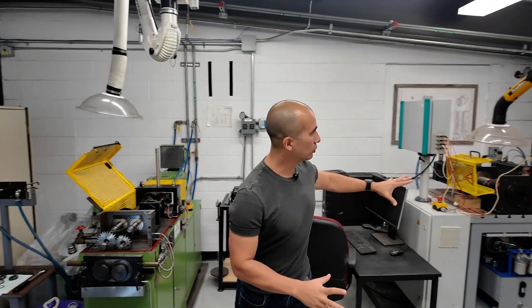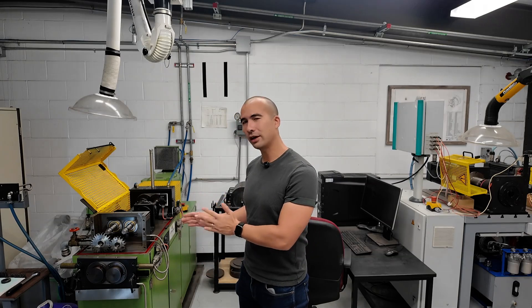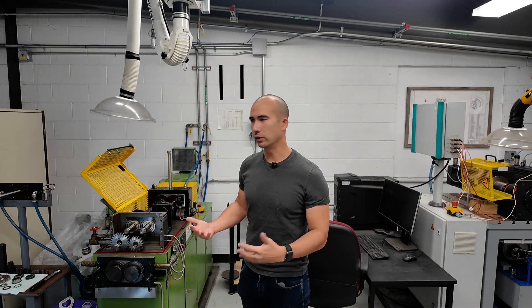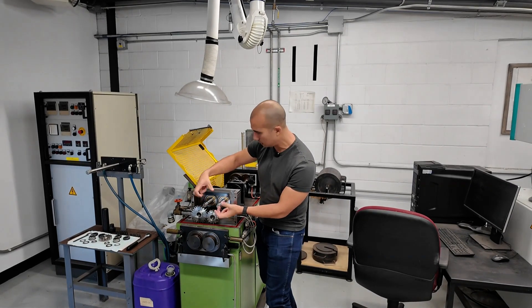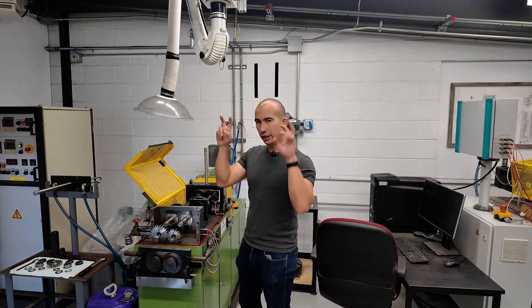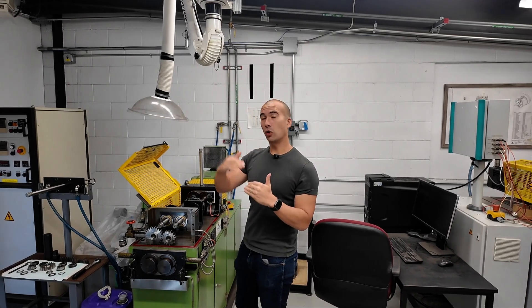Now we're in another room of King Industries Lab, and this time we've got another two different testers. This one is probably the more famous of the two — this is the FZG rig. Anytime you've seen gear oils, go look at the technical data sheet and you'll most likely see an FZG rating. FZG is usually used to test the anti-scuffing performance of the oil. What you can see is a simulated gear system where you've got two gears running against each other, and then we increase the load. You'll see it listed as a fail stage — so you'll get an FZG fail stage 10, fail stage 11. The test actually goes all the way up to 14.